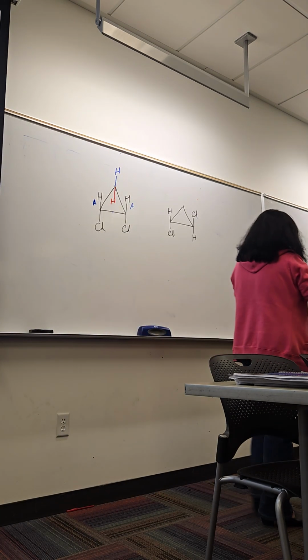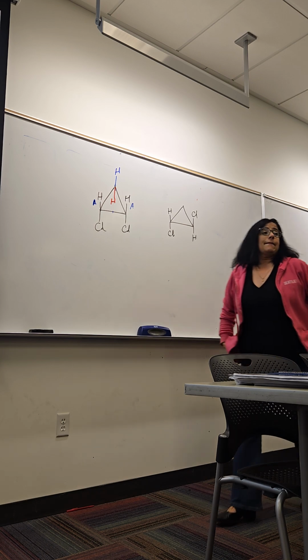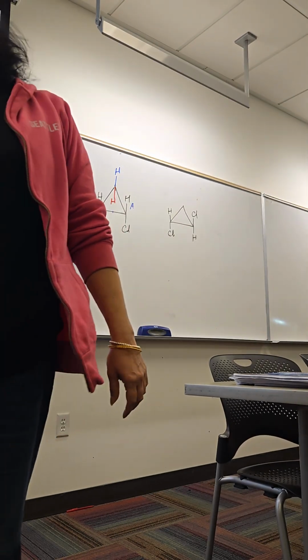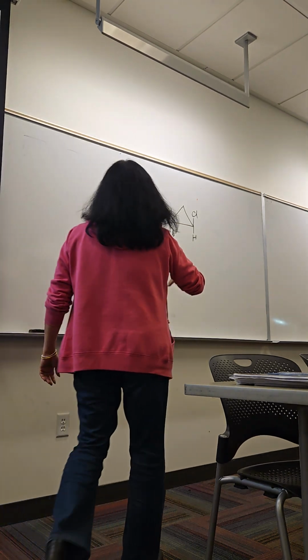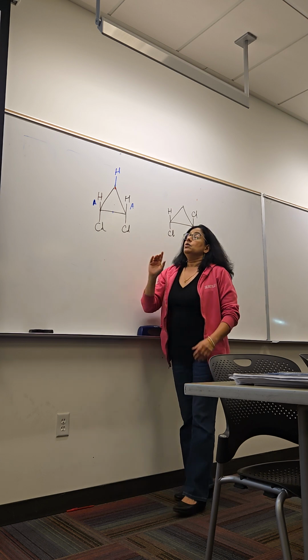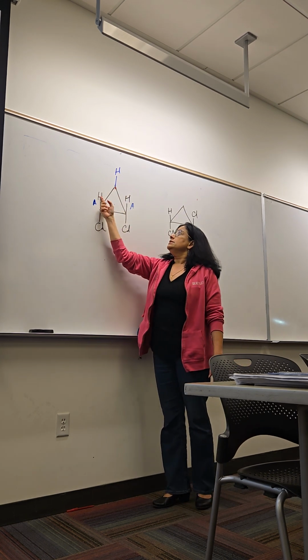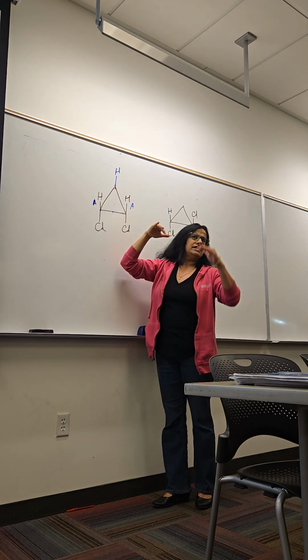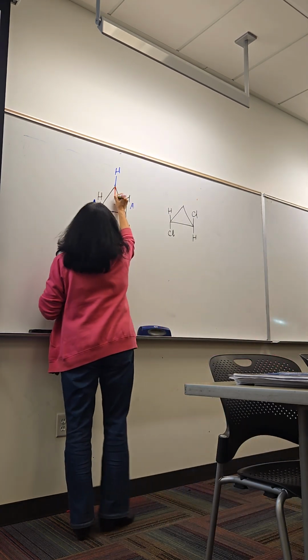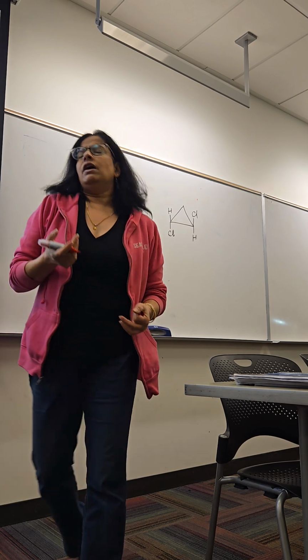Okay, but what's the relationship between that blue hydrogen and the red hydrogen? They're diastereotopic. They're not enantiotopic. They're not homotopic. These hydrogens are diastereotopic. How would you know? Okay, let's just look at the blue. When the blue that's pointed up, what does it see around itself? It sees hydrogen, isn't that right? On the same side of the ring. But what about the red? What does it see? It sees chlorines. Yeah. They're in a diastereotopic environment.